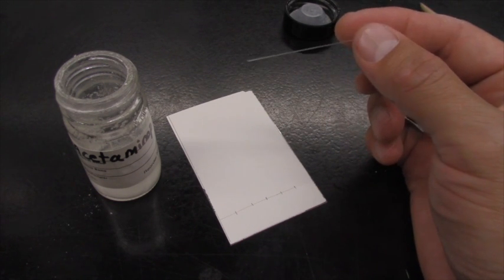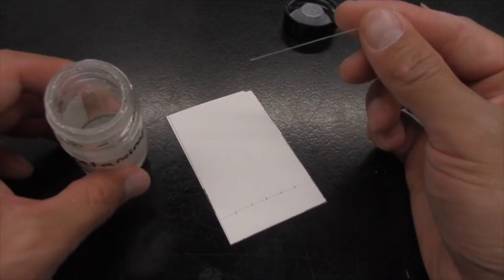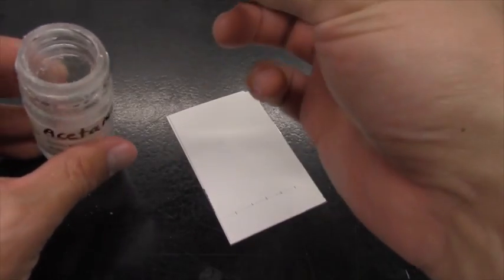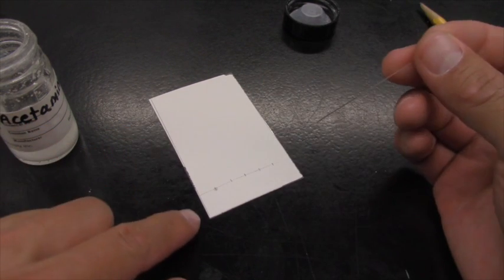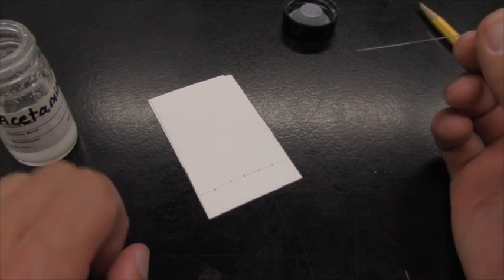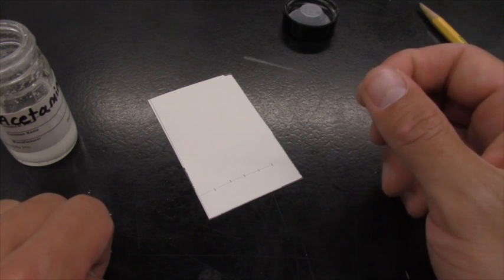So here I've got a spotter or a micropipette, and all I'm really going to do is dip this spotter into the solution and then touch it lightly onto the TLC plate. So you can see here I'm just going to touch it. Really, the amount of compound that you're going to apply is going to vary. So what I would recommend is basically just give it a go. Put down a little bit, and once you develop your TLC plate, you'll be able to tell if you've put too much or too little.